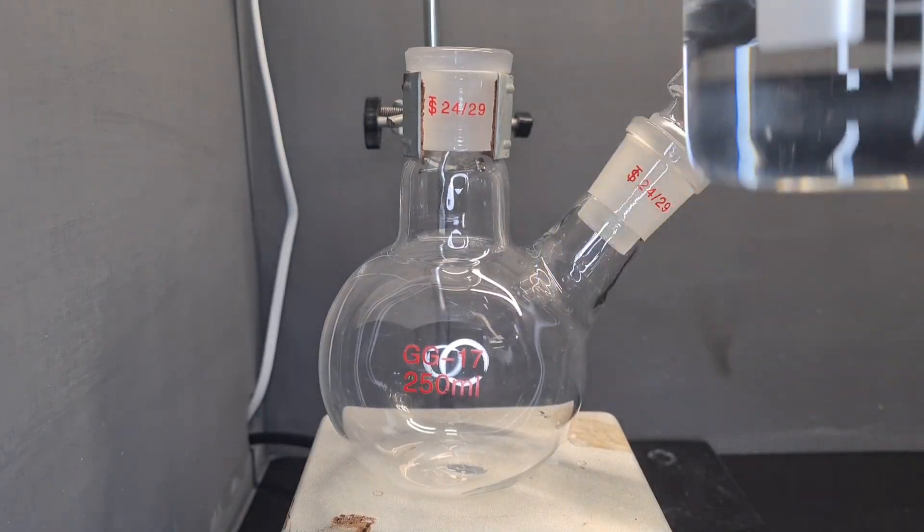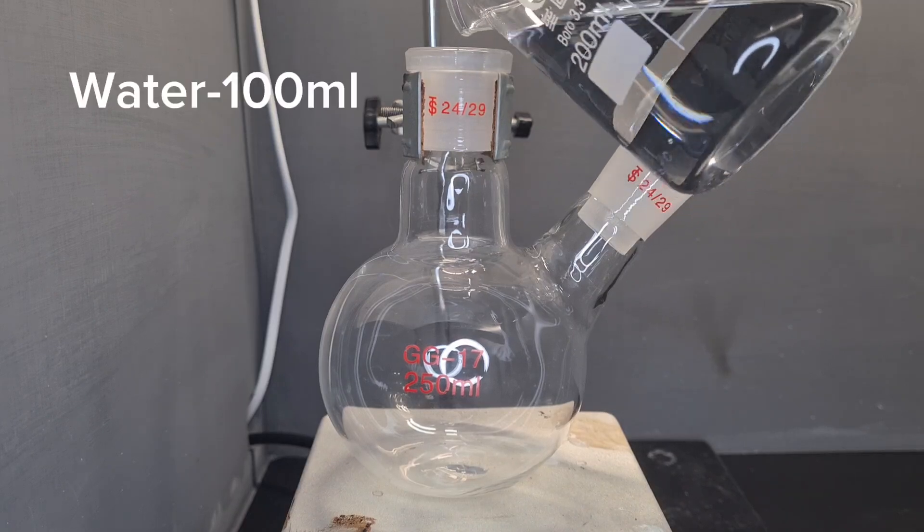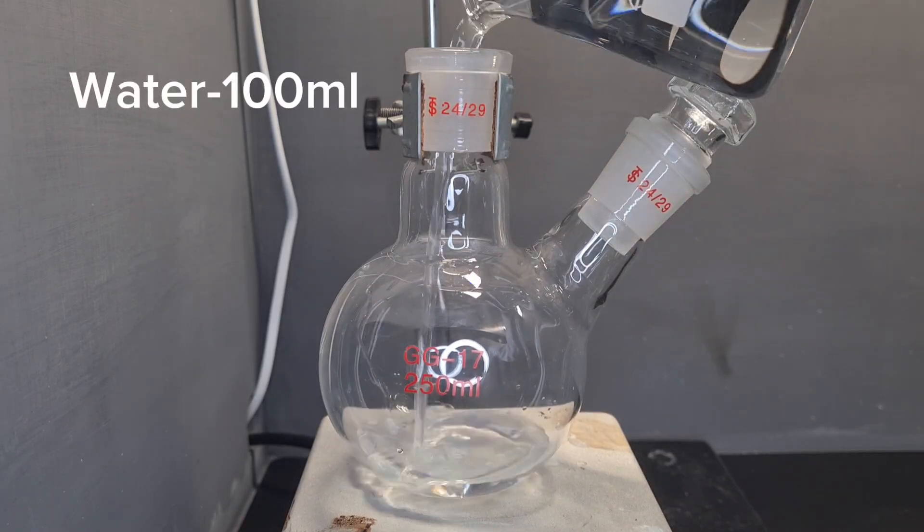Okay, so first we're going to add about 100 milliliters of water to a 250 milliliter two-neck round bottom flask.